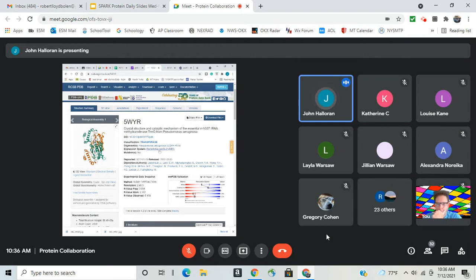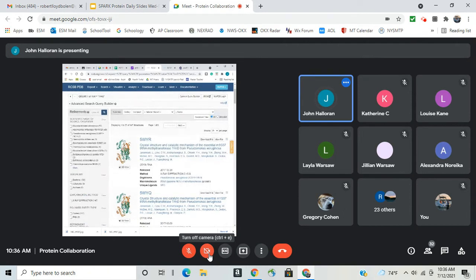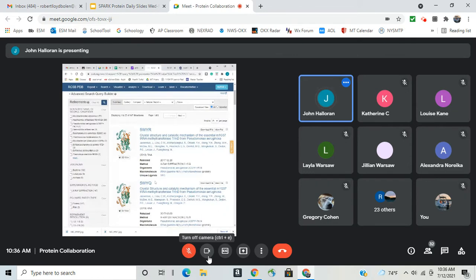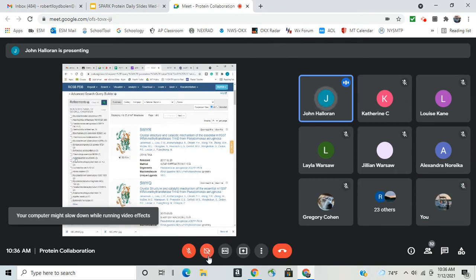And this is probably one of the most common ones because this was made in the early 80s and everyone uses it. Sometimes you'll see other organisms there. The Rosetta system is kind of common. For eukaryotic genes, sometimes they use insects. But usually when you're searching for the organism, this is what you're thinking: what species makes this protein.